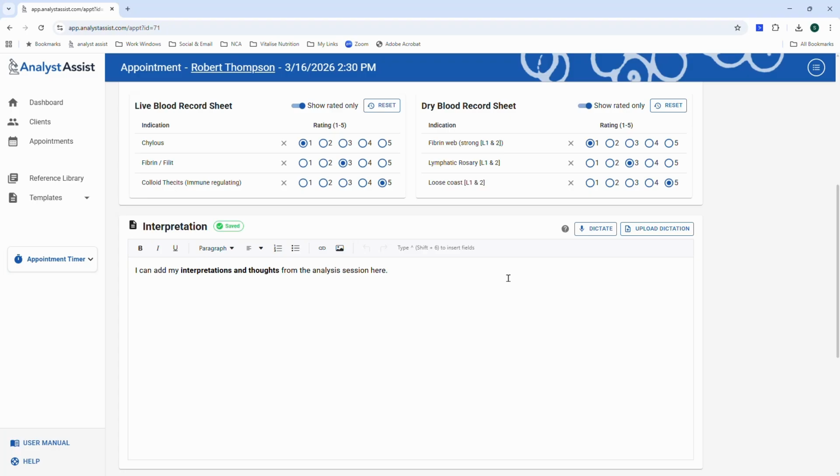To get started, we need a microphone connected to our computer, or the internal one if we're using a laptop, and it needs to be functional. When we click the dictation button for the first time, the app will ask us for permission to use the microphone. Once we've granted permission, the dictation process will go live and we'll see a countdown as the system gets ready. When the countdown is complete, we can start talking.